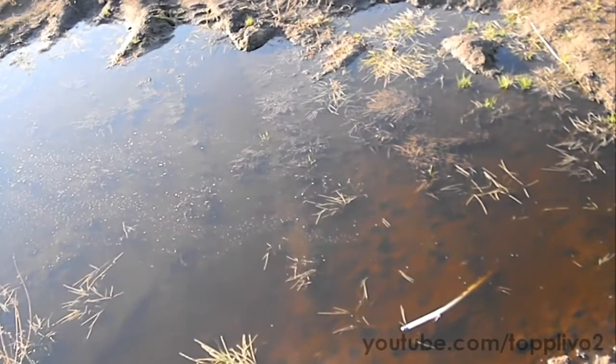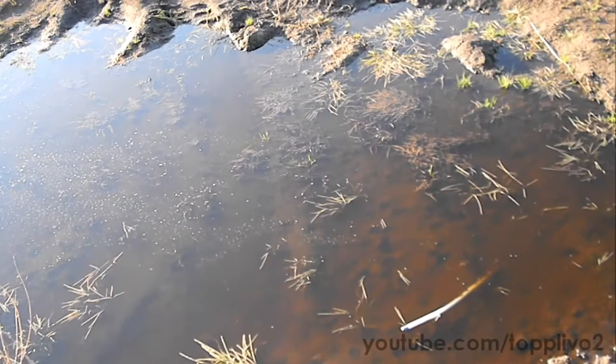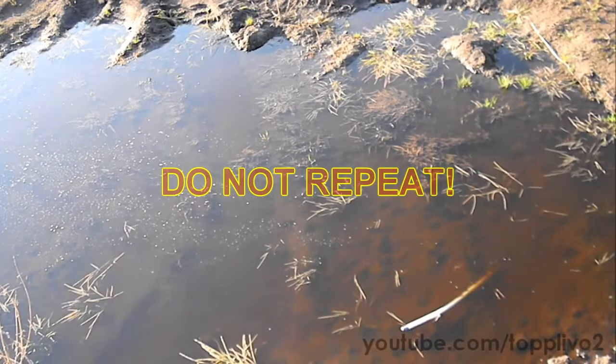Finally, I just can't resist and decide to throw approximately 15 grams of sodium in a large puddle. Don't repeat that experiment by yourself because it's very dangerous.